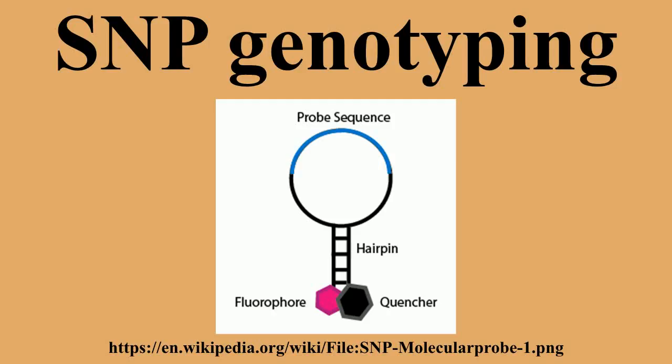SNP polymorphic site. The probes will have a fluorophore linked to the 5' end and a quencher molecule linked to the 3' end. While the probe is intact, the quencher will remain in close proximity to the fluorophore, eliminating the fluorophore signal. During the PCR amplification step, if the allele-specific probe is perfectly complementary to the SNP allele, it will bind to the target DNA strand and then get degraded by the 5' nuclease activity of the Taq polymerase as it extends the DNA from the PCR primers. The degradation of the probe results in the separation of the fluorophore from the quencher molecule, generating a detectable signal.